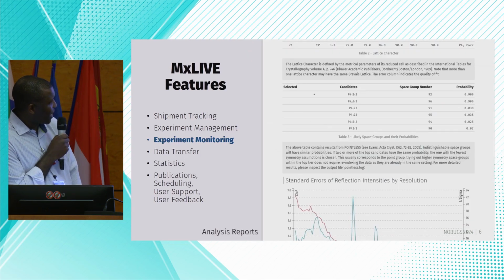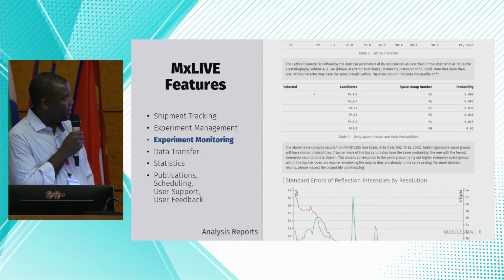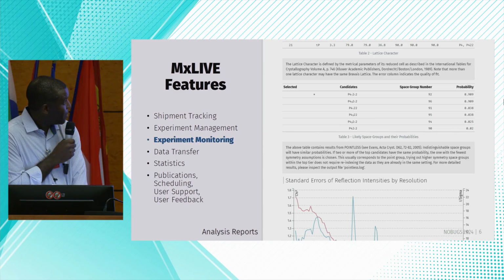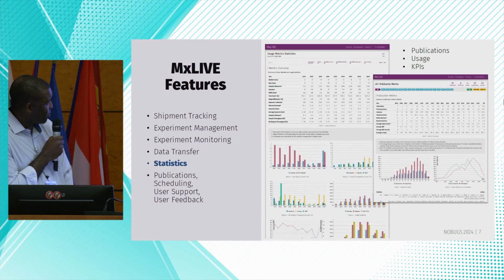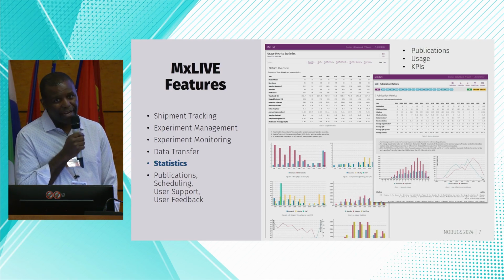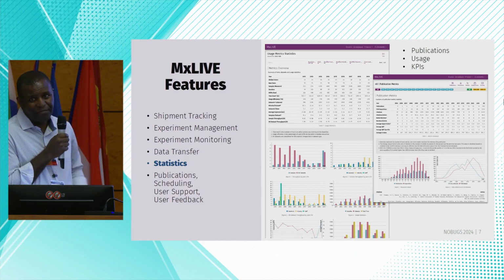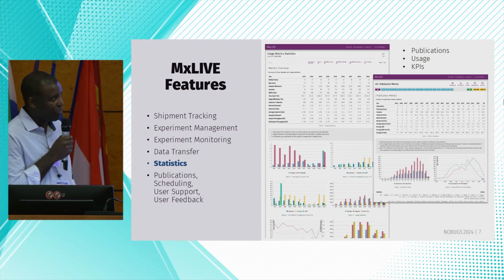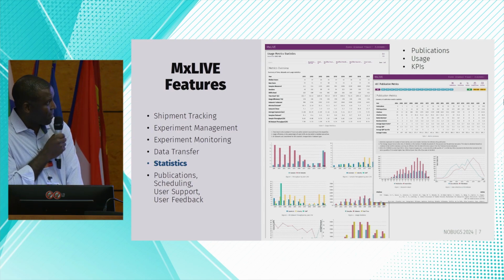We have visualization of data analysis reports within the interface. And MX Live also has lots of statistics that are generated from the metadata that we collect within MX Live. MX Live is similar to iSpyB for those of you within the MX community. The software was developed back in 2010, so it's quite old and has been updated a few times.